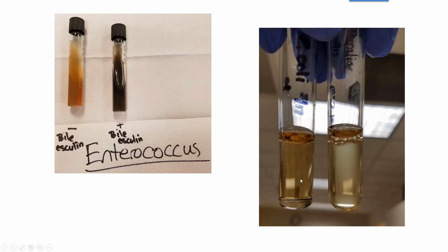And so on your worksheet for the sodium chloride broth, there is no substrate, there is no product, there is no indicator. A positive reaction is just turbidity or cloudiness in the tube. So hopefully I answered all the questions. Again, you might have to look through some of the lab exercises. You can look at the PowerPoint itself and flip through and stop anywhere you want to fill it in as well.